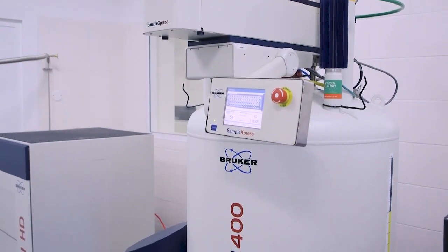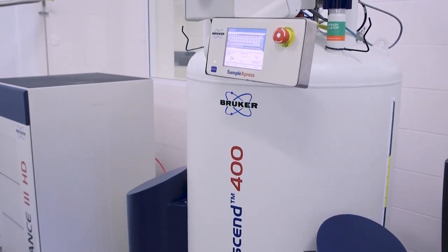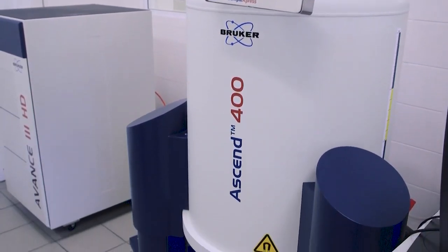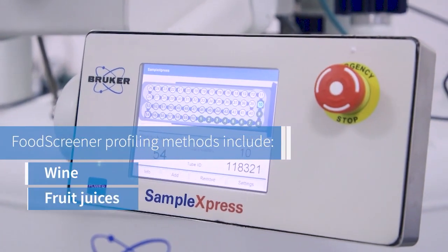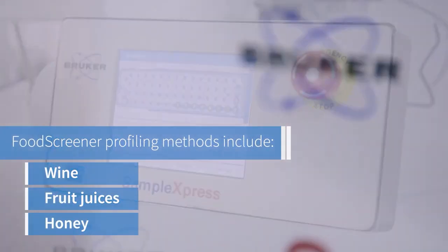Bruker's Food Screener is a fully automated tool based on magnetic resonance, which allows food producers and retailers to ensure the quality and authenticity of their products before they go on the market.